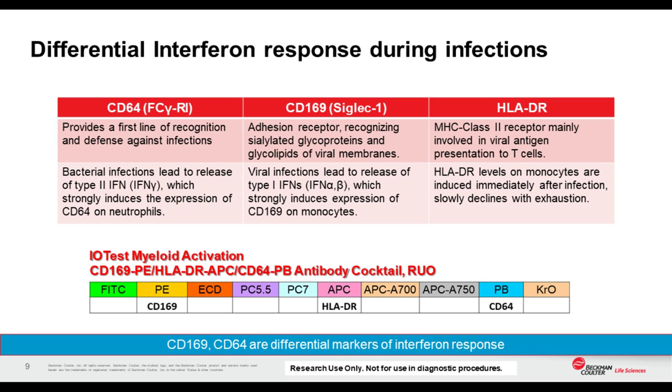The specific differential markers of infection and interferon signaling are CD169 and CD64. We have also included HLA-DR as an indicator of the immune status to the assay platform.